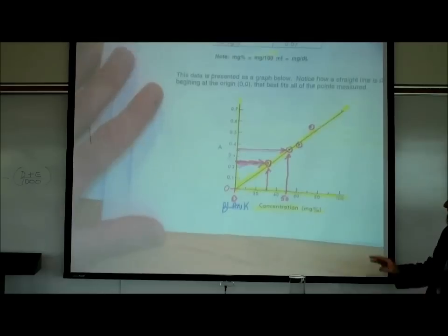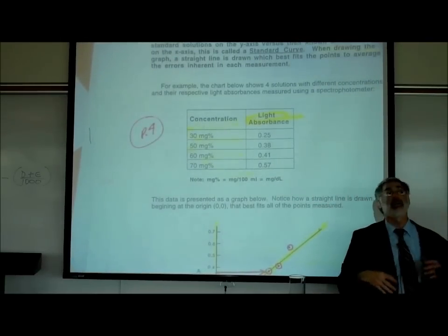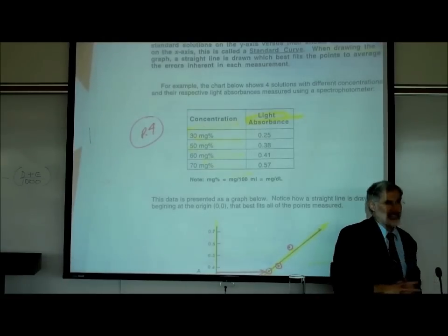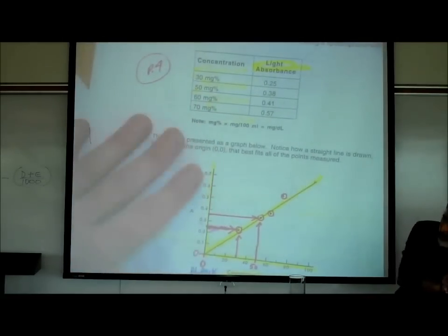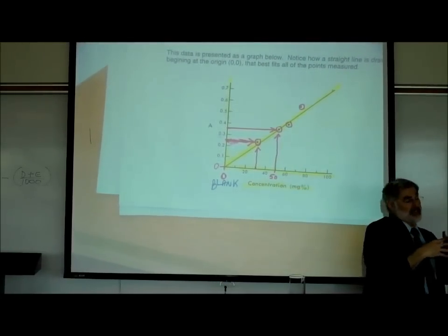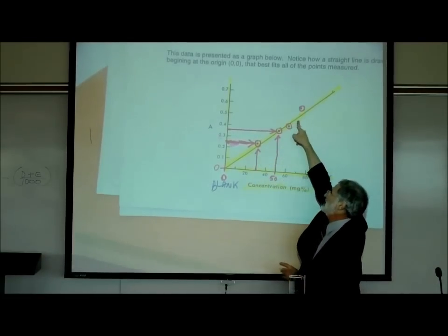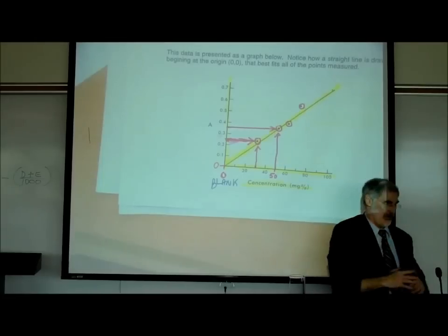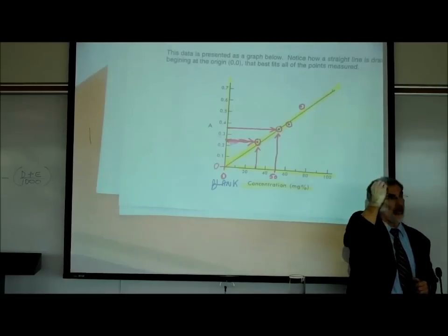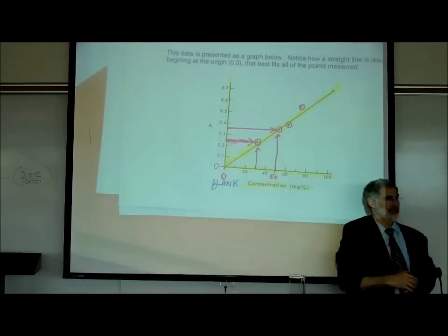Now, using many known data points is actually considered more accurate than using one data point. When we look at this graph line, they don't all line up in a straight line because of problems with both accuracy and precision, but we hope that when we draw that straight line, it cancels out our errors. But we can't just ignore any single data point, because we don't know. This data point could be the most accurate of all these, so we can't ignore it.